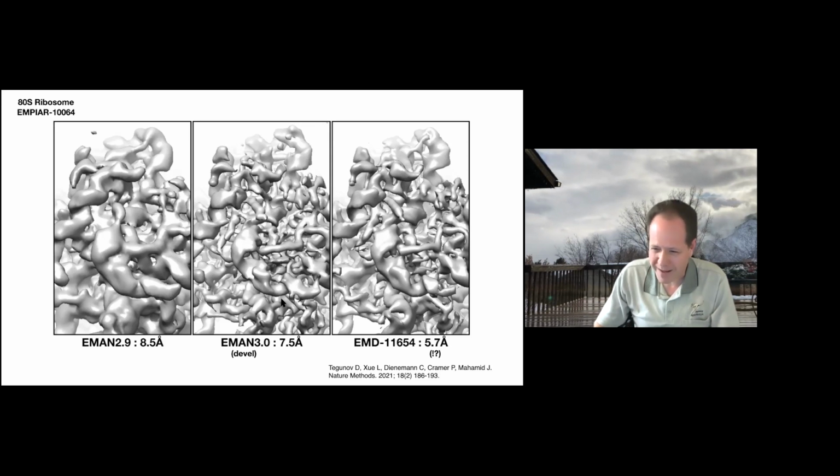In single particle analysis, things have become pretty standardized and there aren't nearly as many problems with exaggerated resolutions, but in subtomogram averaging, it's only now that people are getting to the resolutions where it really matters. And you'll find there are still some tricky little things that are being done. But in my view, I think our structure is at least as good as this structure. Anyway, you can judge for yourselves.